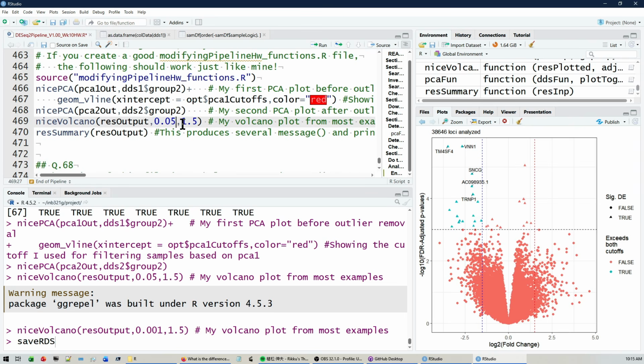In the end, though, these are not you making medical decisions with these plots. This is you exploring correlations. And so the values should reflect what's a realistic acceptable error rate. For an exploratory study, I'm okay with a 5% chance that the gene I've picked is unrealistic. Now, for the record, I'm doing lots of tests, so that number gets a little hard to interpret. But that's why I'm using what's called the adjusted p-values and not just the regular old p-values.